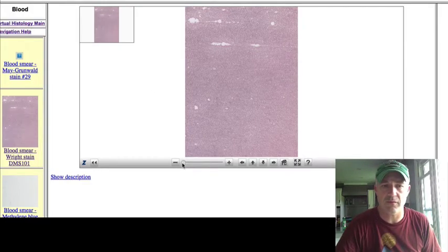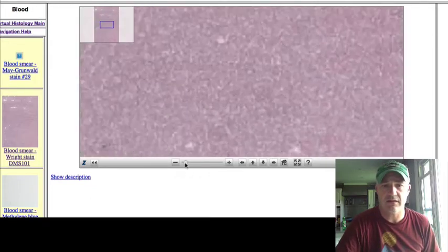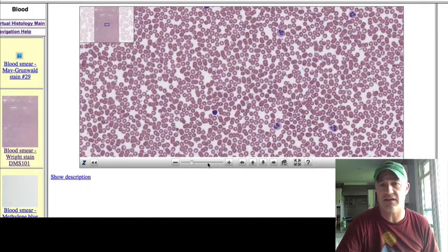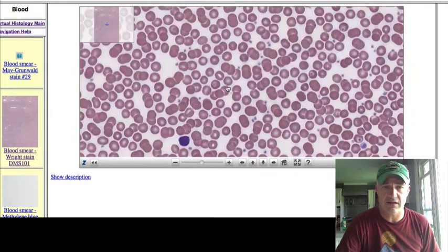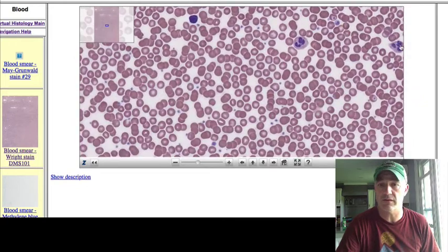I'll show you just a couple more types of tissue that you need to be able to identify. This first one here, when it gets to blood cells, we will do a lot more with these later on, but this is just an example of blood. So you can see the actual red blood cells right here, platelets, and then these would be white blood cells, the darker, more purple ones here.